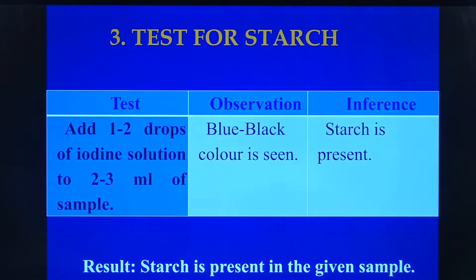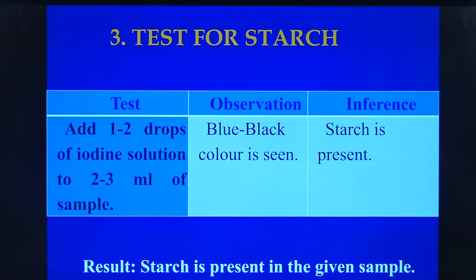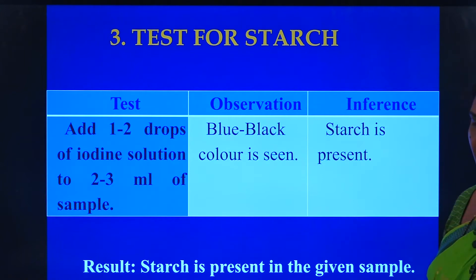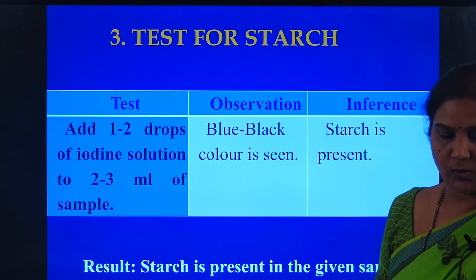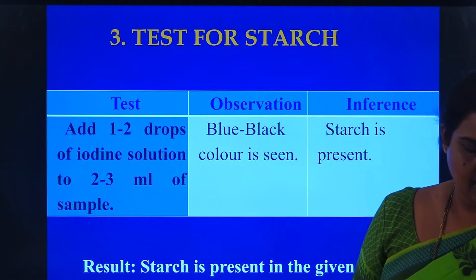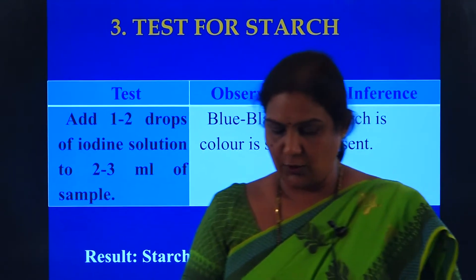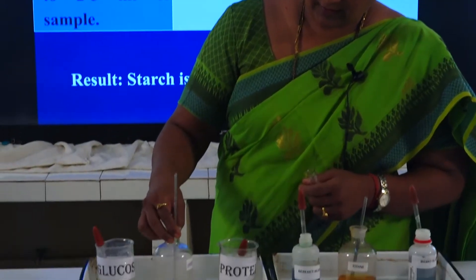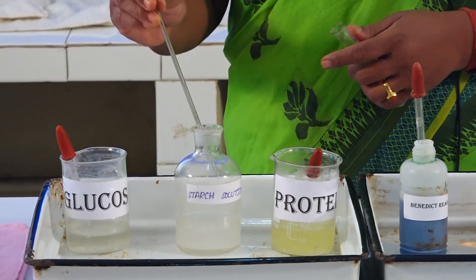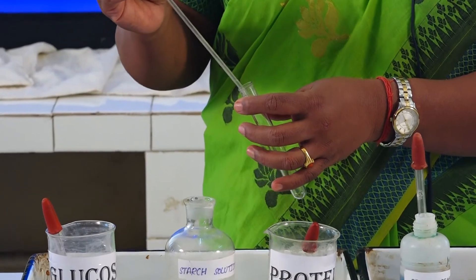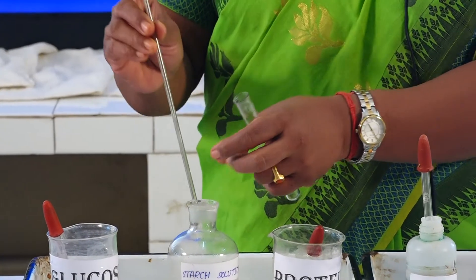Next, one more carbohydrate test — the test for starch. While conducting the test for starch, we will be using iodine solution. It goes like this: take a test tube, add the starch sample, and then we will be taking one or two drops of the iodine solution.